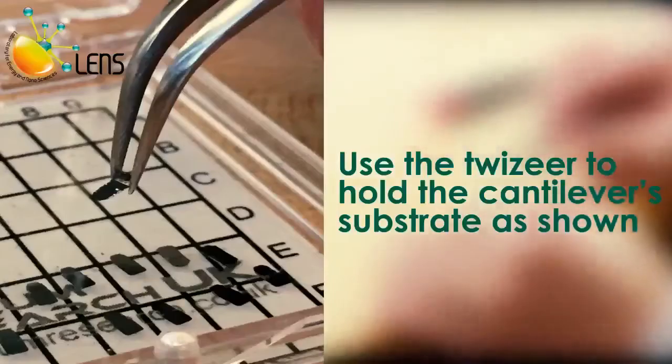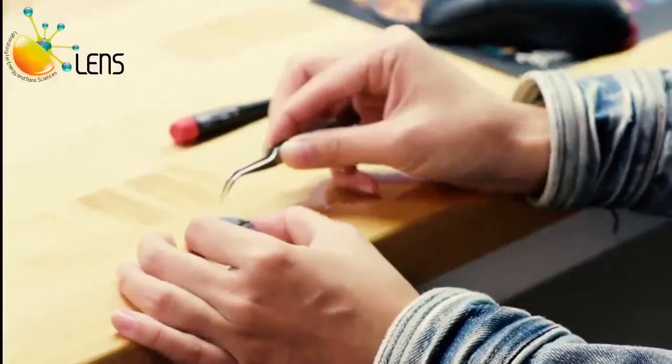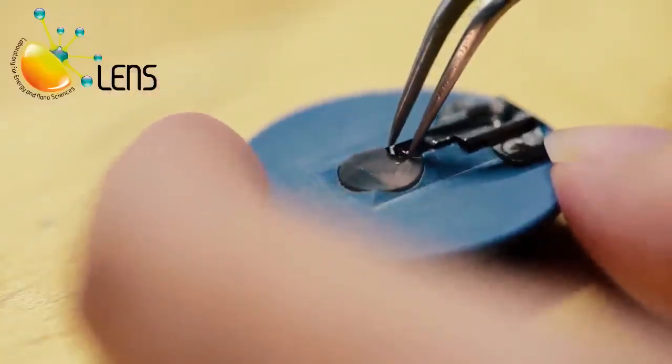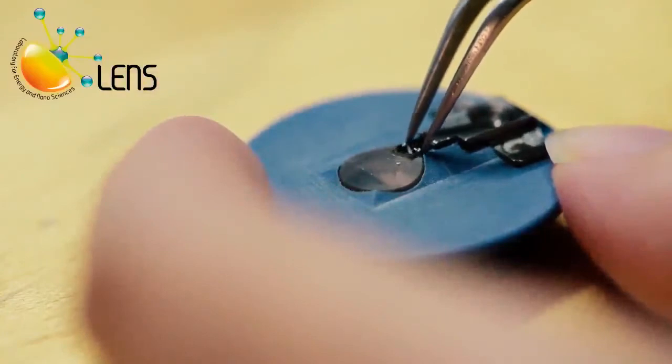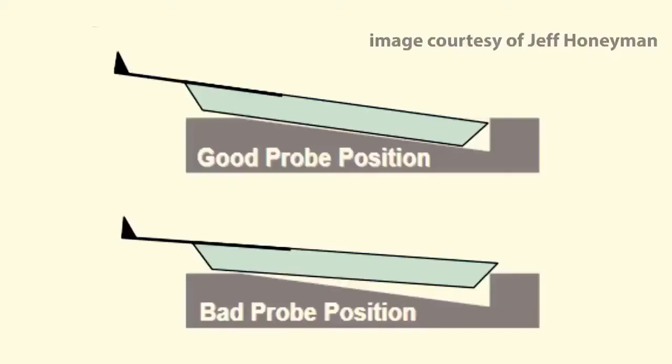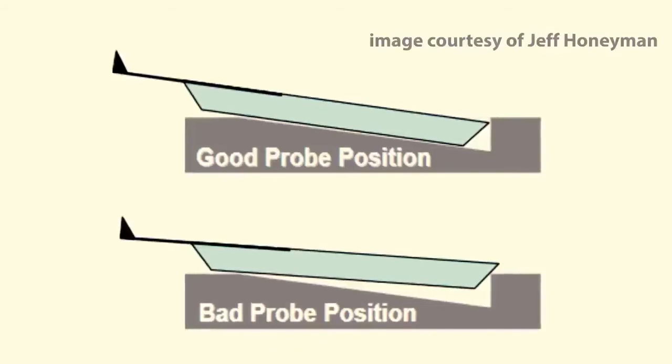Using tweezers, slide the new cantilever, tip side up, beneath the spring clip. You can use a magnifying glass. Verify that the tip is well-seated and aligned in the pocket. Carefully slide the substrate under the clip and tighten the screw. It is advisable not to push the substrate all the way back in the pocket as this can cause the substrate to lift off the floor of the pocket, compromising the deflection signal.